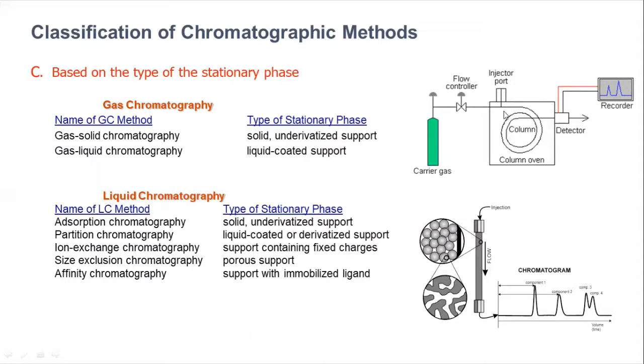But in modern instruments for gas chromatography, the injector port is no longer necessary because we use an autosampler, so you no longer inject the sample.